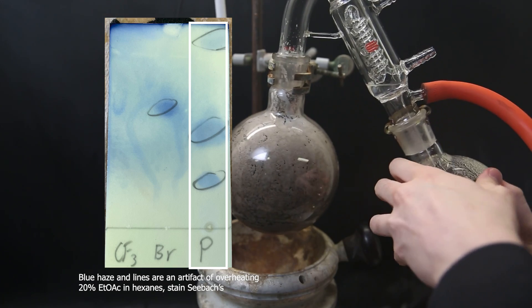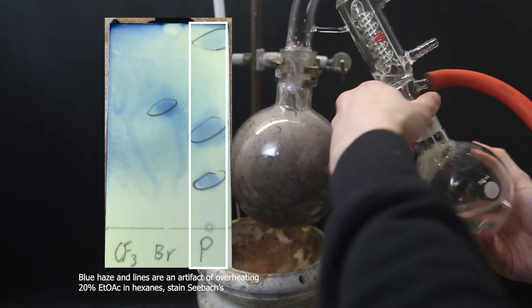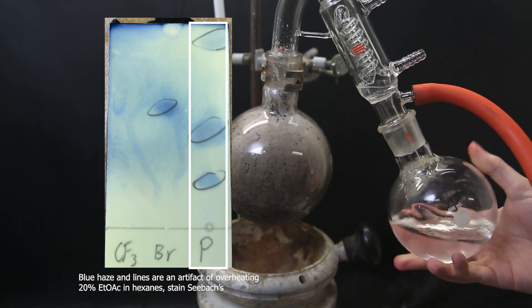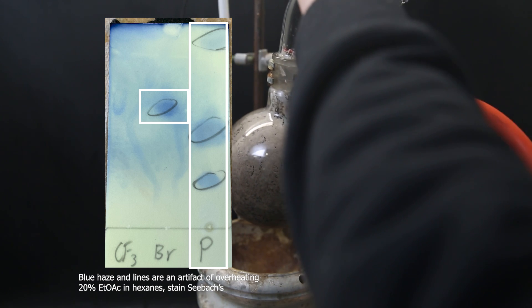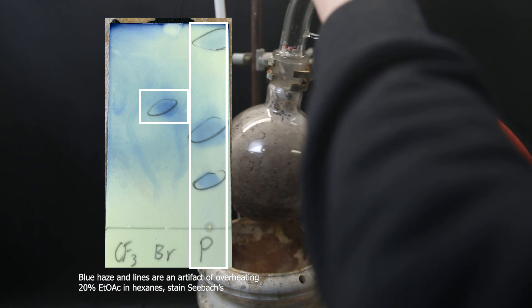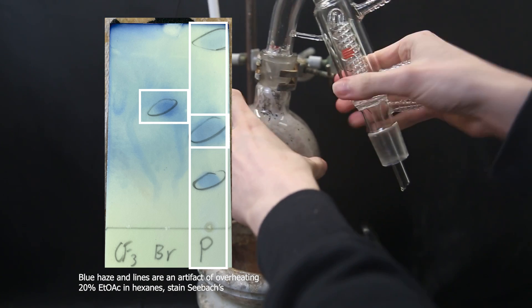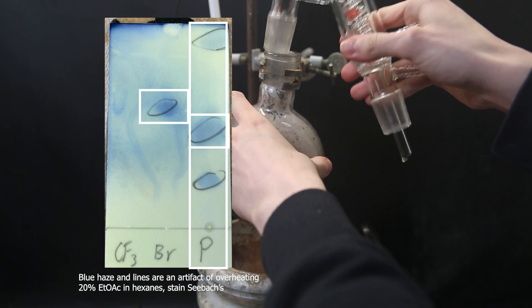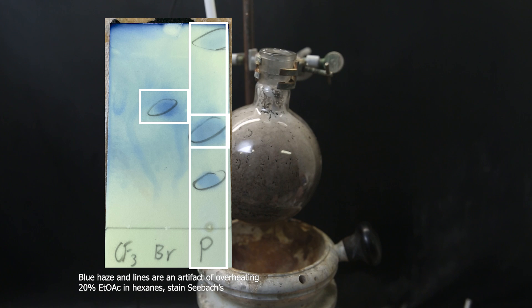Now we have three unknown spots. One is the product, and the other two are impurities. I expect the product to have similar polarity to 4-bromo benzaldehyde. So I assume that the spot closest to it is the product, which is also the biggest spot and might be an indicator that it is the major product, though it depends on how well each compound stains.